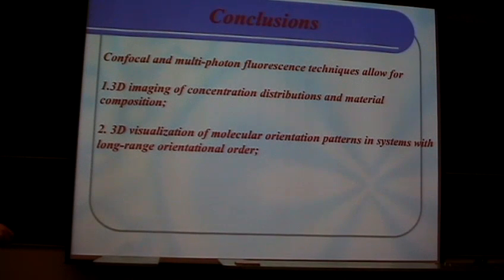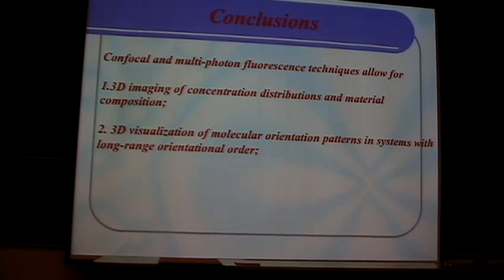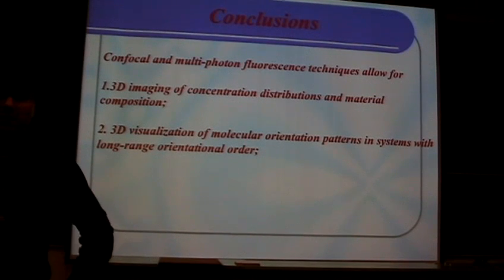And so with this, I would like to conclude my lecture for today. I hope I was able to demonstrate that confocal and multi-photon fluorescence techniques allow for three-dimensional imaging and imaging of concentration distributions and material composition in both biological and soft matter systems. And they can also allow visualization of orientational patterns in systems with long-range orientational ordering, such as liquid crystal media.